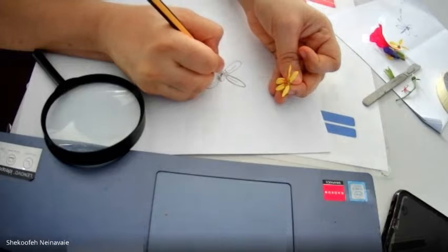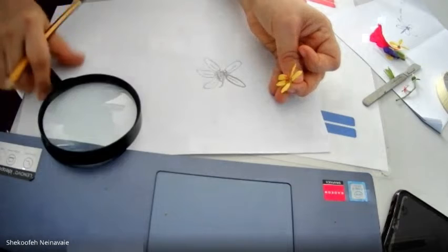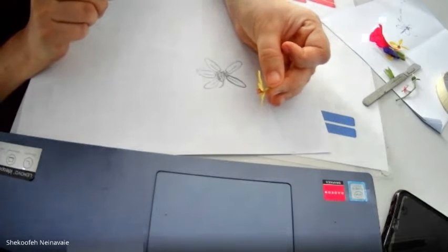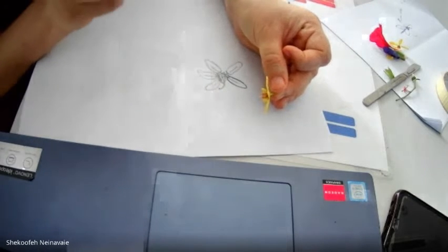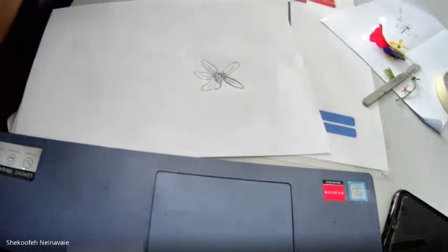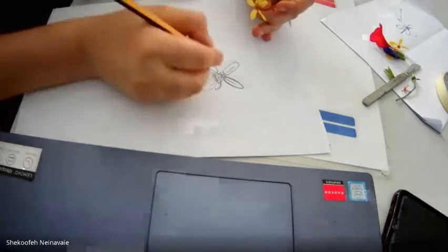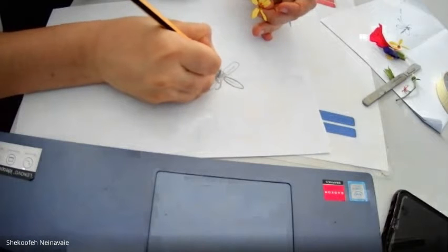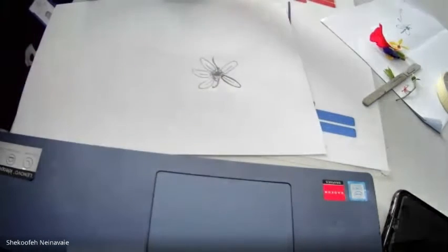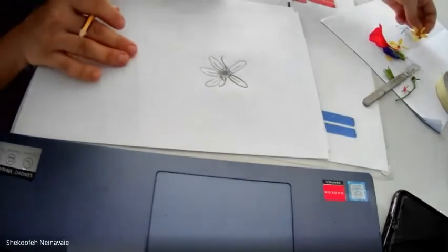And in the middle, it has a very long female part. It's like a small tongue, right? The tip is a bit rounded, that's where the stigma is. These are the details that I'm actually noticing. And I look at the base, the ovary. Yes, it's obvious from here. It is a little bit like that. And the stalk of the flower. So these are the details that I need from this flower.